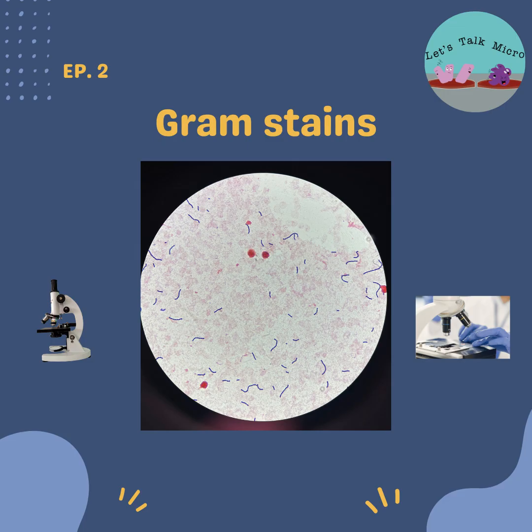We add some drops to a device, like a funnel with the slide in it, and then we centrifuge it. By cytocentrifuging it, we bring all the cells together. We are concentrating that sample so we can look at it in the microscope. Another way is if you have sputum or bronchial washes. Sputums tend to be thick, so you put a swab in it and then swab that on your slide. For bronchial washes, bronchial lavages, you put a drop of that lavage on the slide. So you see, it just varies with the samples.